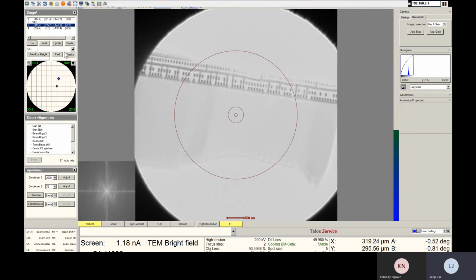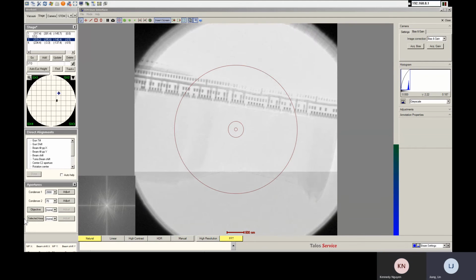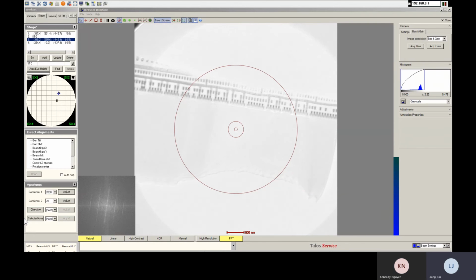Diffraction right now. Okay, it's your turn. So let me give you control. So if you need a hand panel, tell me how to do it, and I'm gonna move stage and also find the region you want for you. Okay.